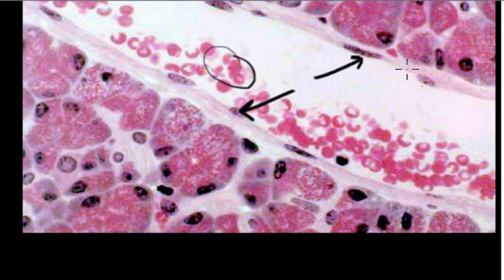And you can actually, thankfully, make out the cell. So, I'm just going to outline the cell with my pen here, roughly. So, there's the cell. And you can see the nucleus over here in the middle, right here. And you can see that it is flattened, indicating once again that that is a squamous epithelium.